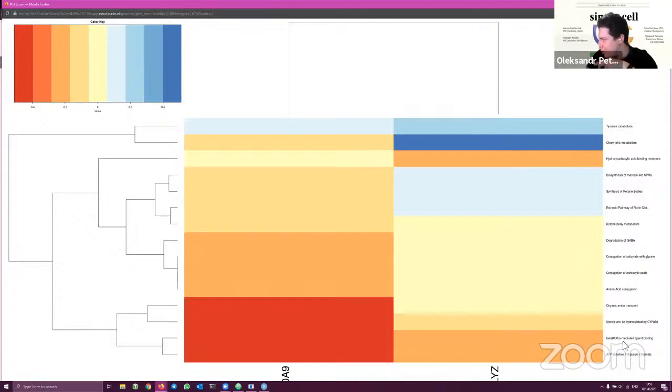For example, beta-klotho mediated ligand binding, and it appears very much not enriched. So it's minus 0.4, right? Not exactly enriched in the hepatocellular carcinoma cells. So for that, we can take this bold suggestion that maybe this specific metabolic pathway is affected somehow in the hepatocellular carcinoma. However, what we should really specifically consider is that we had a lot fewer cells of this left identity as compared with the right identity.